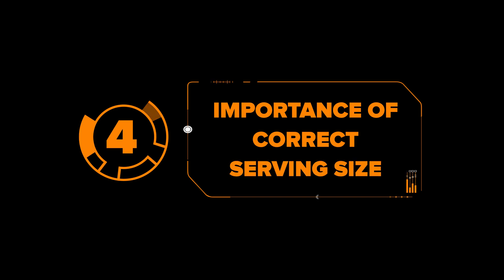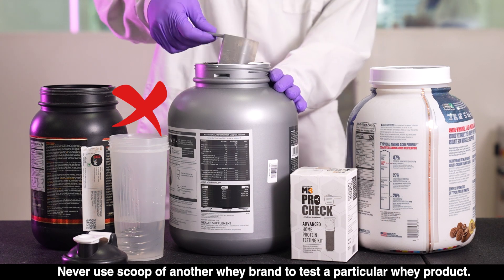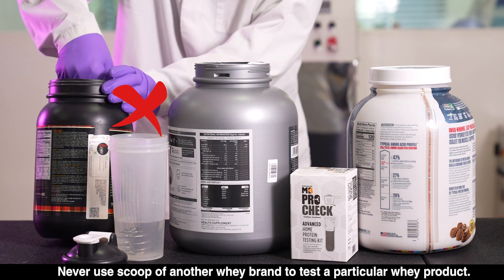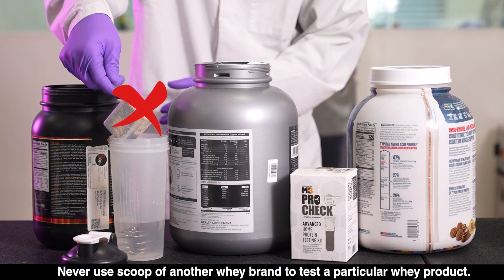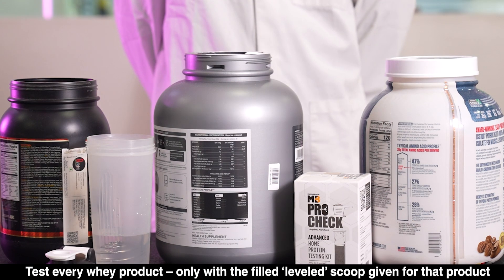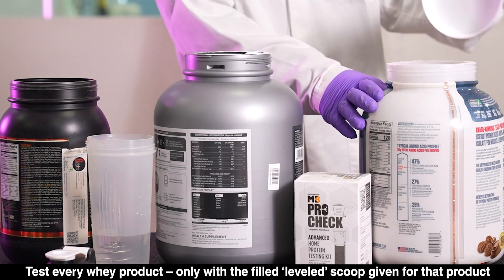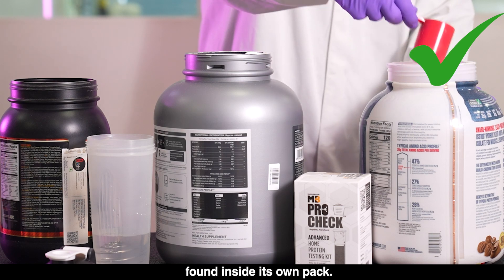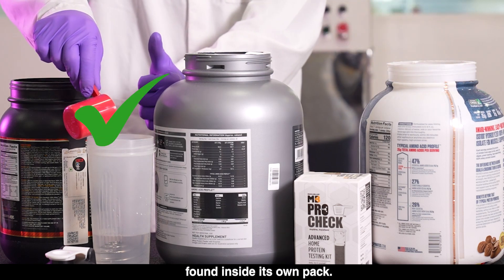Mistake 4: Importance of correct serving size. Never use the scoop of another whey brand to test a particular whey product. Test every whey product only with the filled, leveled scoop given for that product, found inside its own pack.